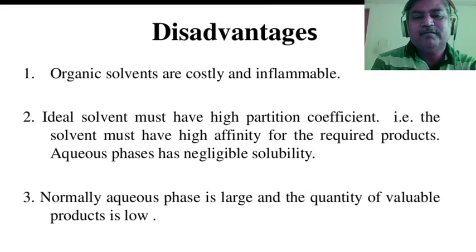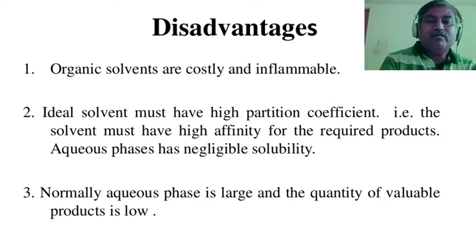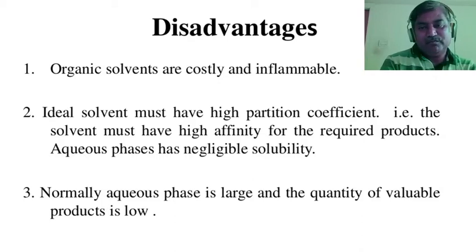Now what are the disadvantages of this process? Those solvent systems which are used for this countercurrent technique are very costly and inflammable. Hence this technique is comparatively costlier than the batch process.